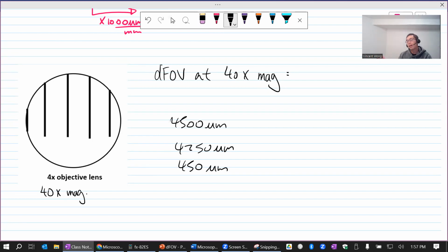Well, I will accept a range of answers, okay? I'm not looking for a specific one, but this is your thought process, hopefully. Yeah, Bibi, you have another number you want to give me? I don't know why, but I thought it was 40 times 10 times 4, which is 1,600. No. The magnification has nothing to do with the ruler.